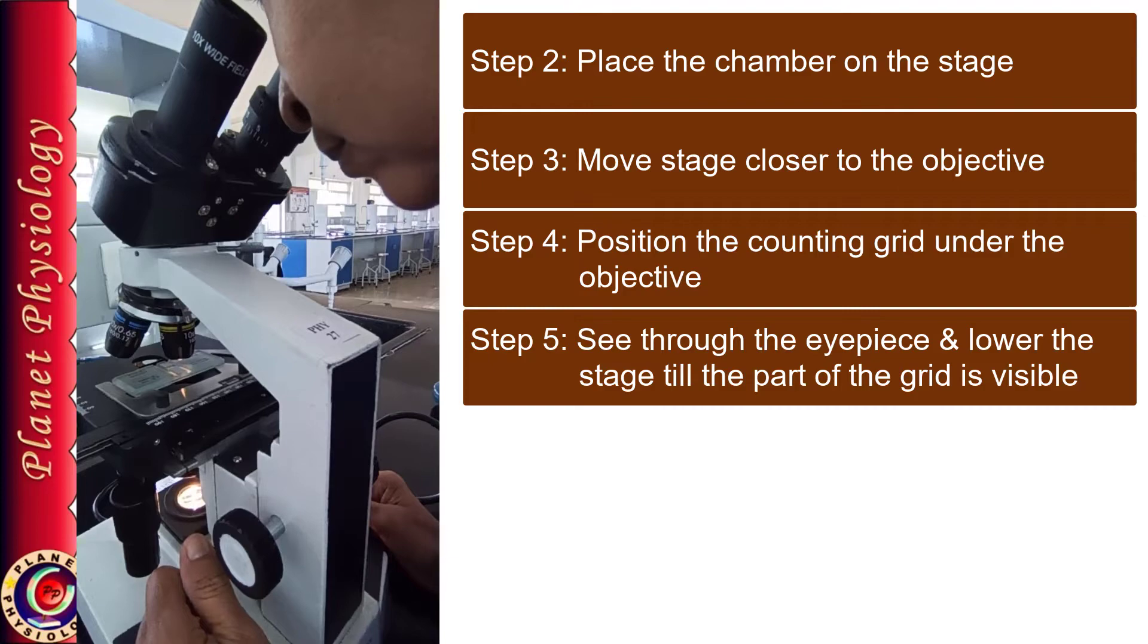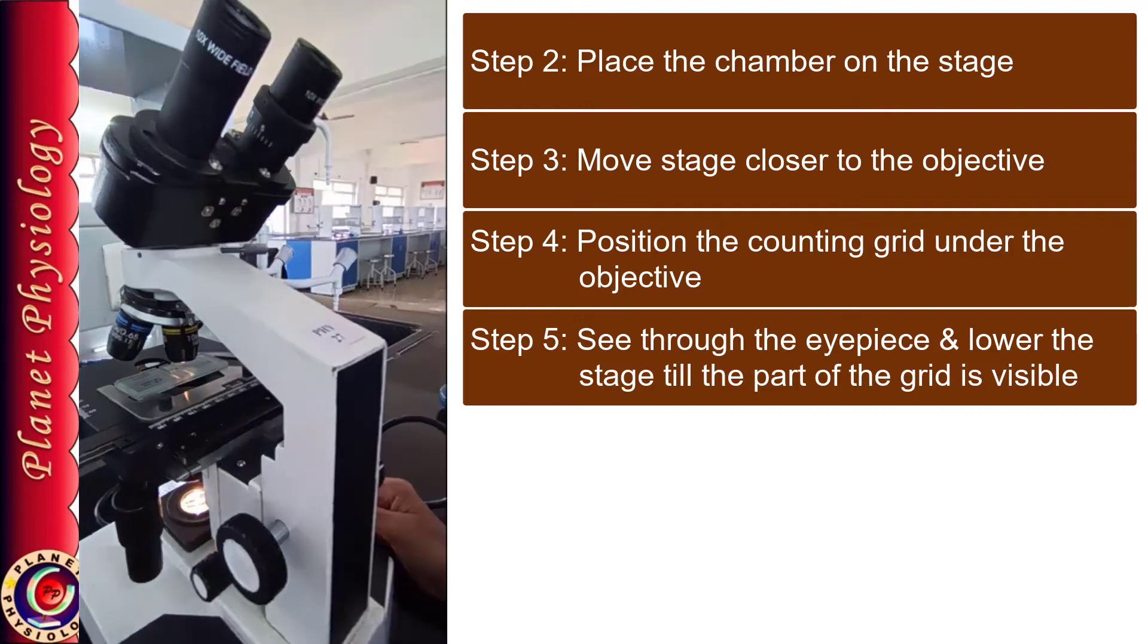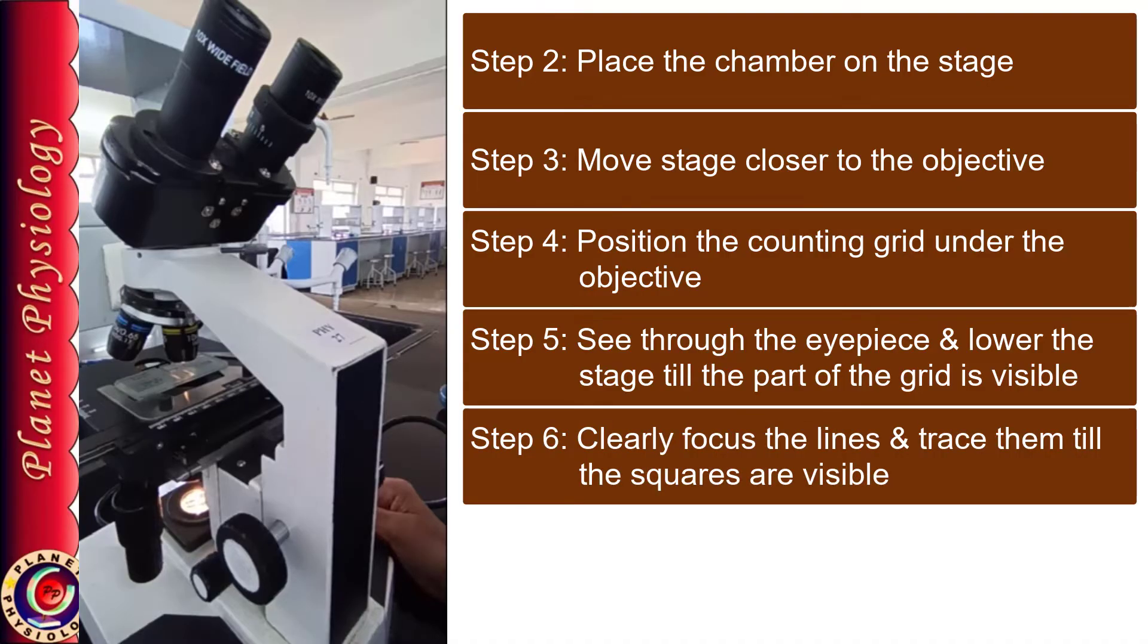As here, I can see only lower part of the lines. I cannot see lines down but I can see some lines here up. Once the lines are clearly focused, do not use fine or coarse adjustment screws at all.